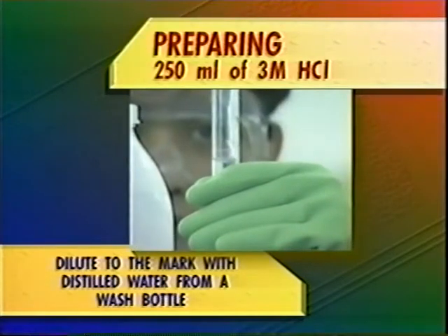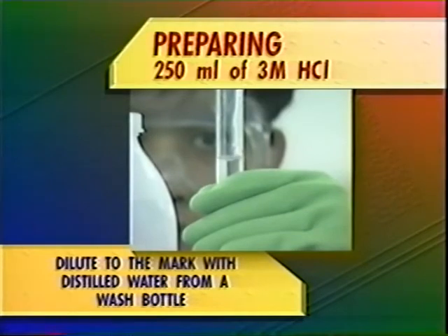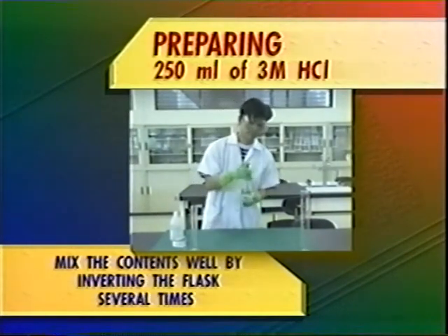Dilute to the mark with distilled water from a wash bottle or a Pasteur pipette. Stopper the flask and mix the contents well by inverting it several times.